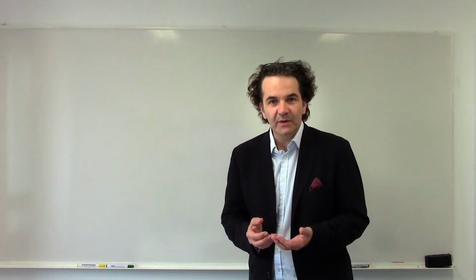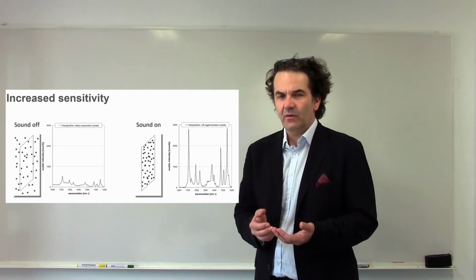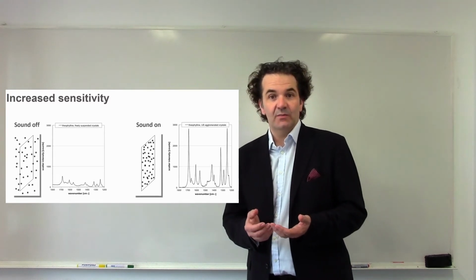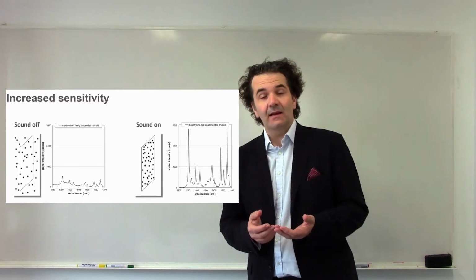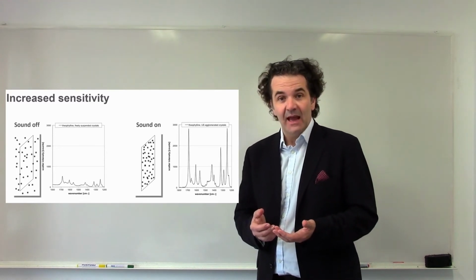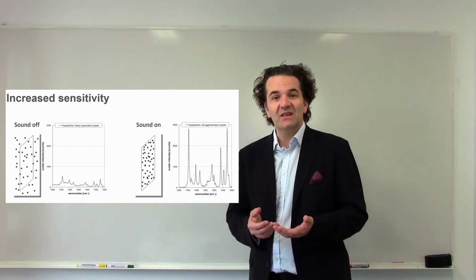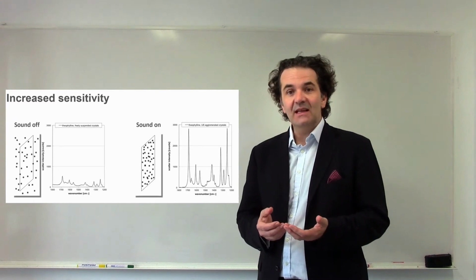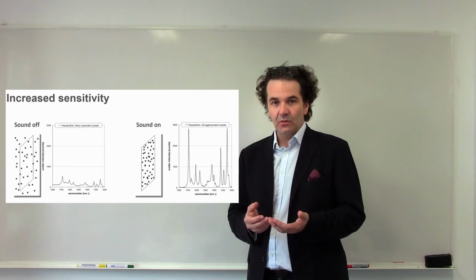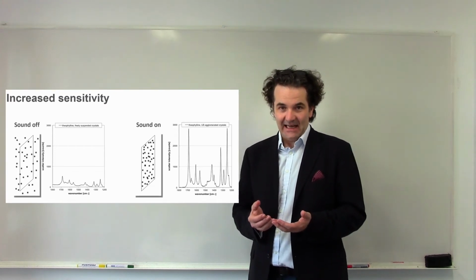Now the improvement becomes clear when you look at those measurements. These are Raman spectra of theophylline crystals forming. On the left hand side, the spectrum is taken from freely dispersed particles. On the right hand side, the spectrum was taken from an agglomerate of crystals, and you see instantly a very much higher, crisper, more distinct signal, which is easier to interpret. We have compared these signals to other signals, it resembles about the signal of a sediment.